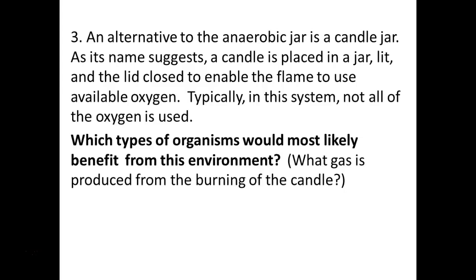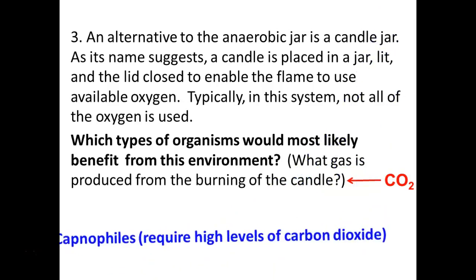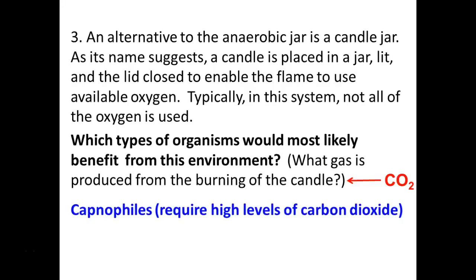Microaerophiles. And a specific subset you just mentioned, the capnophiles, because what are capnophiles like that's going to increase in this as the candle burns? The CO2. Right? So those guys, which are a type of microaerophile, you're not going to eliminate all the oxygen, but most of it will be.